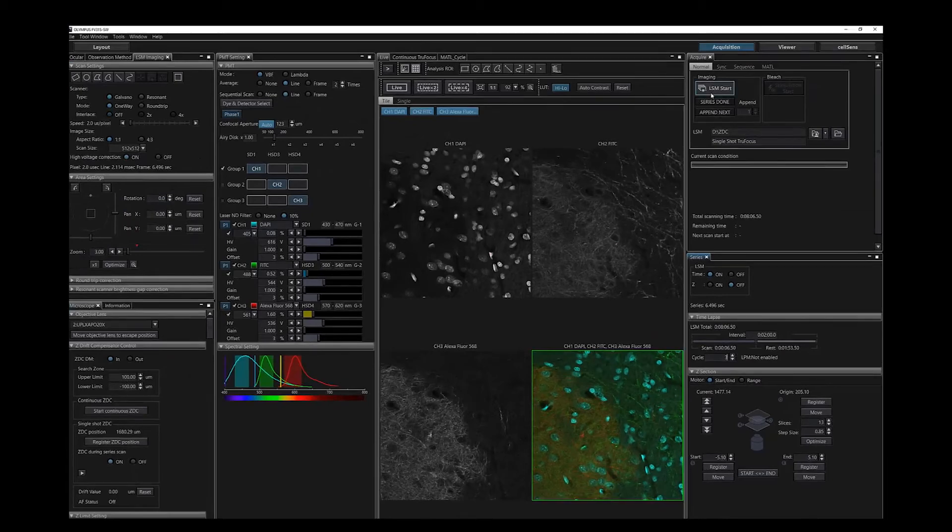When the TrueFocus module is functioning correctly, you will hear a single beep before each image is acquired.